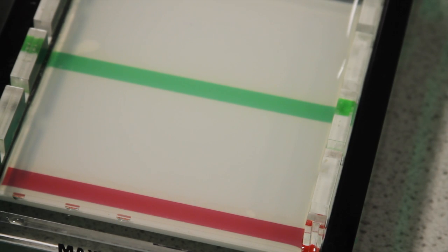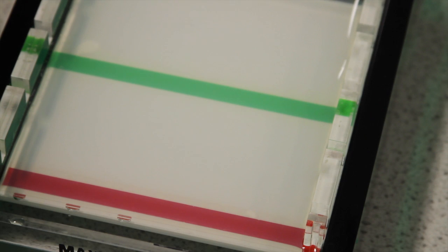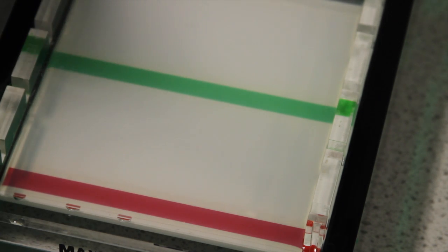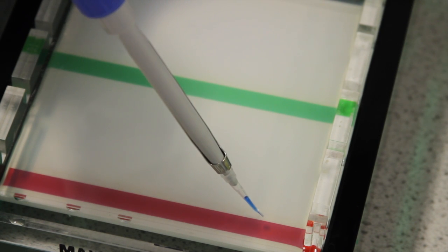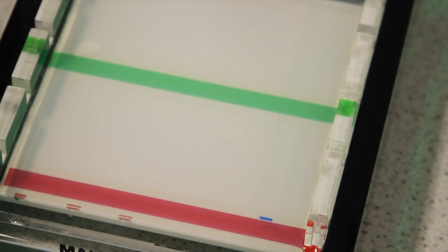Here the first two samples loaded are marker lanes. These are solutions of DNA fragments of known sizes. Draw the sample into a small pipette tip and carefully insert the tip below the surface of the liquid just over the well you want to load it into.